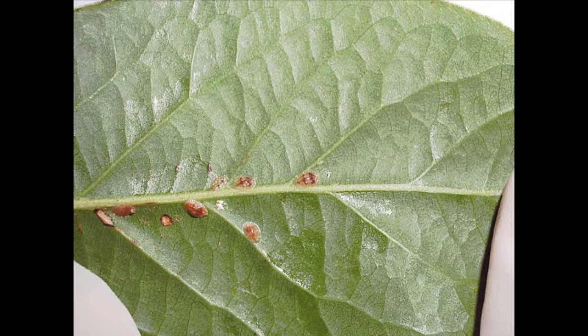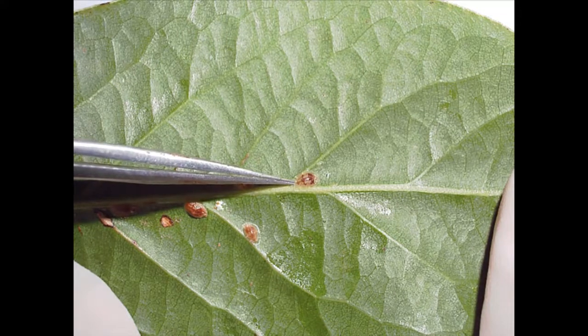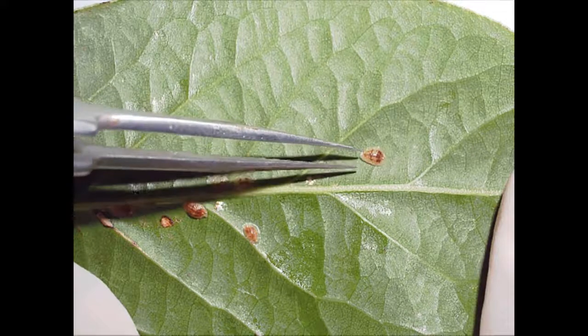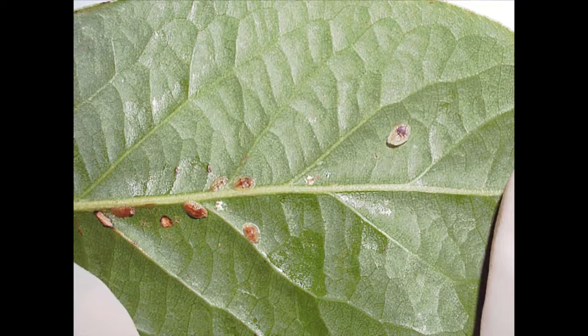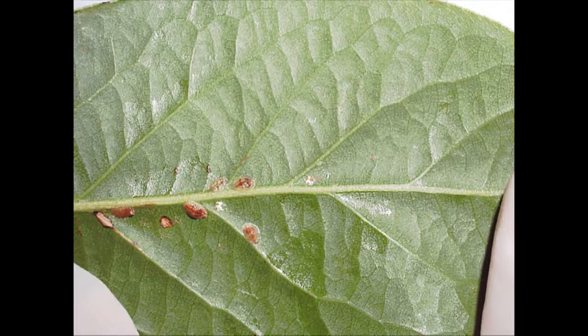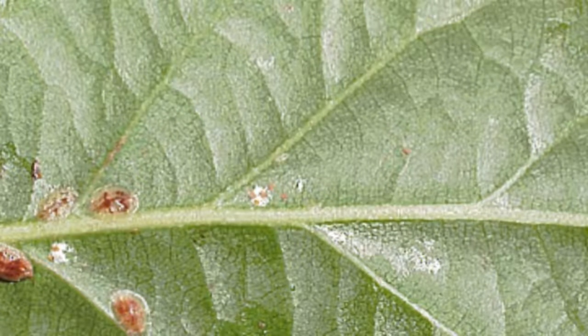Here we have a live plant sample that contains adult soft scales. You can see these soft scales are lined up on the midrib. So what I'm going to do here is remove one of the adult females. Here I pry under it with a fine forceps, and occasionally they'll just pop off like that. It's hard sometimes to pick them up. I'm having a hard time here. So I'm wetting the tip of the forceps in KOH, the next step. It acts like a little suction cup. Take it away. And you can also see some live crawlers on the leaf, shown here.